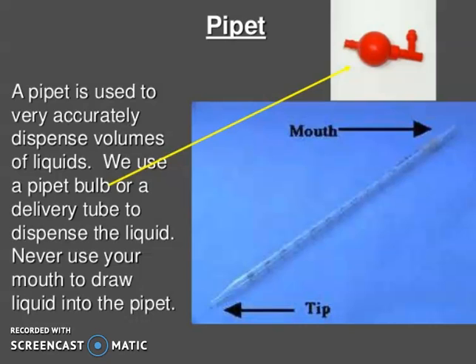Now you have the pipet bulb. You can use this bulb for the delivery.